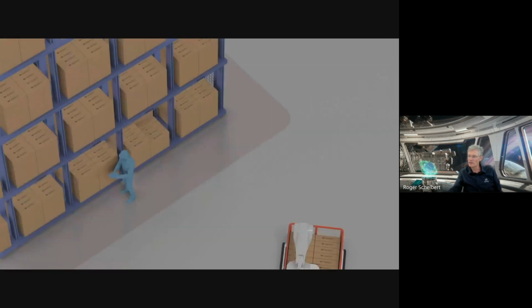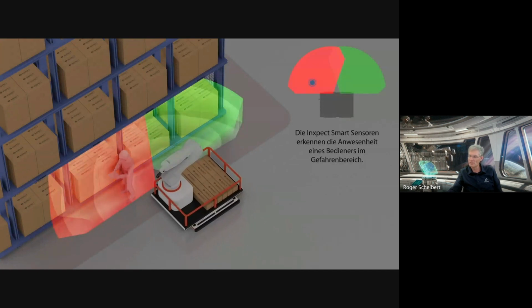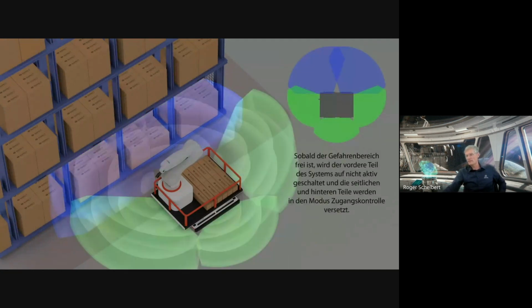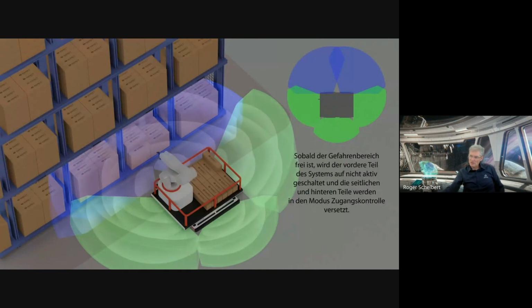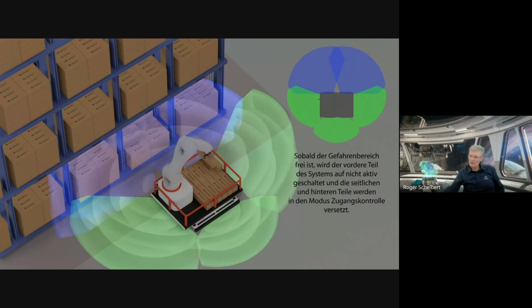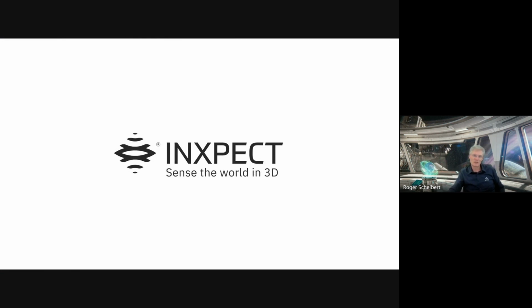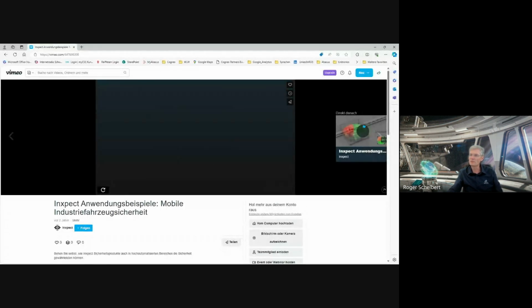If it detects that there is no human anymore, then the robot will be enabled to work. As you can see in this video, there is a human in the range where the robot wanted to work. This is how we utilize it in the lab automation system. And as soon as the man is gone, the robot can pick, and it is now allocated with new radars all around itself, so that you can see there is a safe zone where you can work.